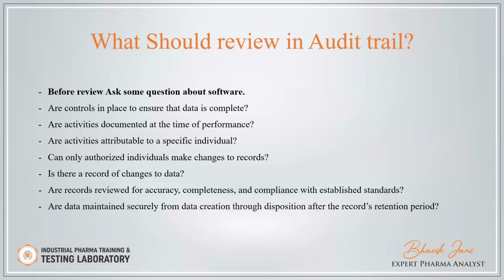Are activities documented at the time of the performance? Is the data contemporaneous or not? Are the activities attributable to the specific individual? Are username, user date and time available in the software or not? Can only authorized individuals make changes to the record? Who has the access right to change the record? Those users should only change the record with justification or some authorization.